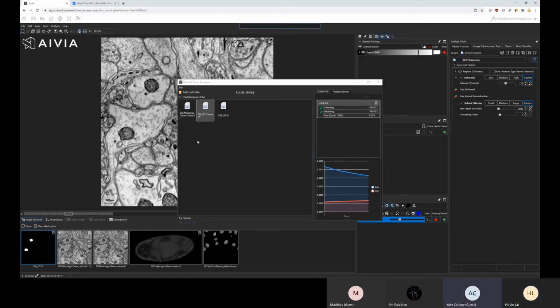So it's doing a projection. I wouldn't do it slice by slice. I'm assuming that your slices are all in focus, correct? Yes. It's a very tight 3D stack right around the cell, so there is no out of focus information. I see. And I think it's about 8 slices thick, if I remember well.